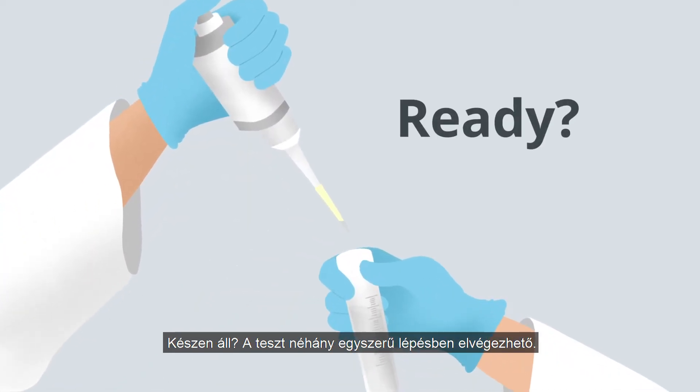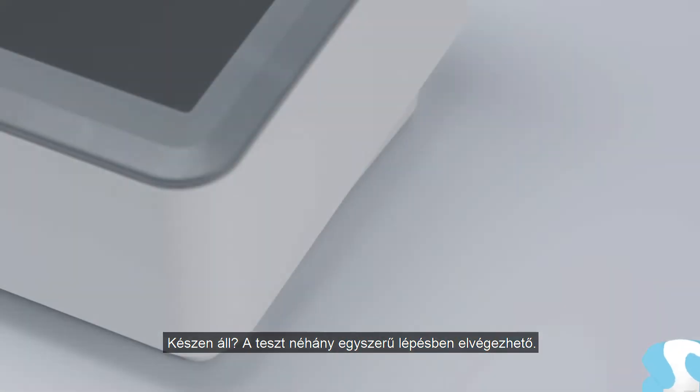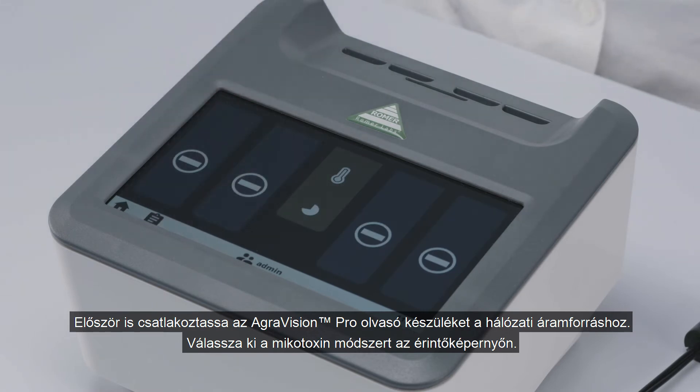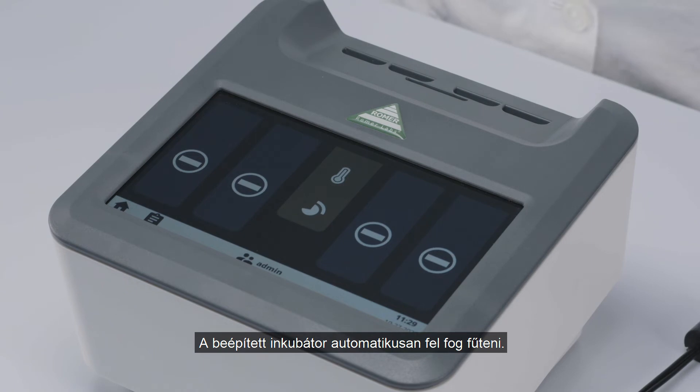The test works in just a few simple steps. Begin by plugging in the AgraVision Pro Reader. Select the mycotoxin method via the touch screen. The built-in incubator will automatically heat up.